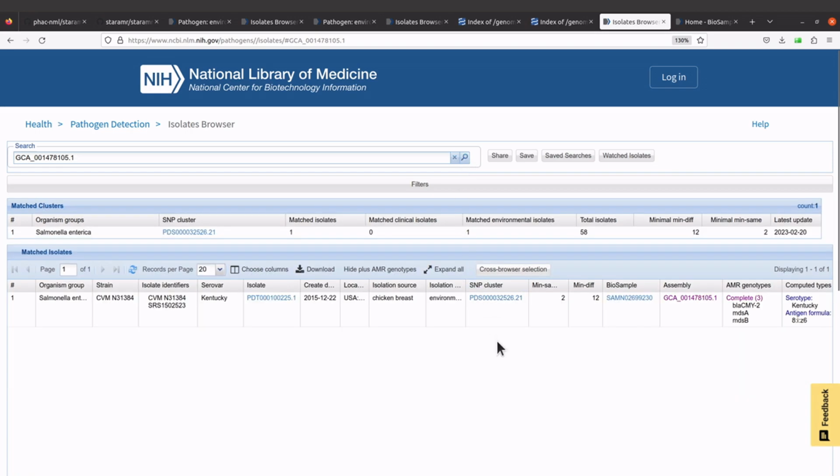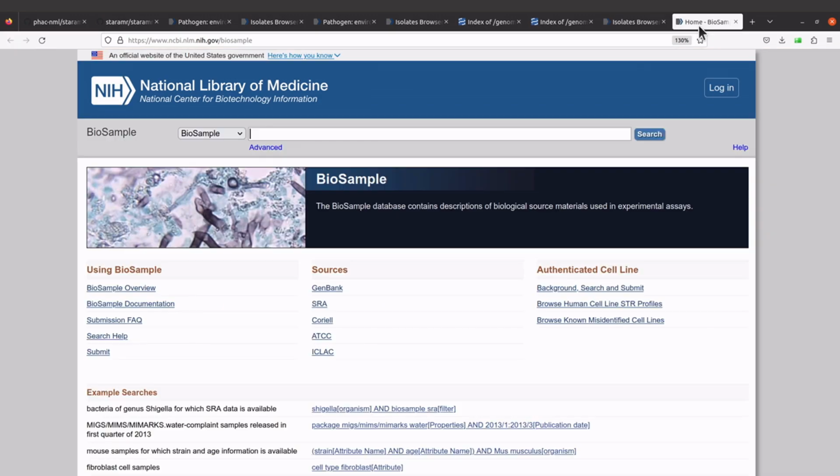Once you search, if your session ID is correct, then the page will be open for you. So we can see the page. This is what we did previously when we visited this page, but now we are searching ourselves. So this is how we do it. You can do the same for the phenotypes as well.